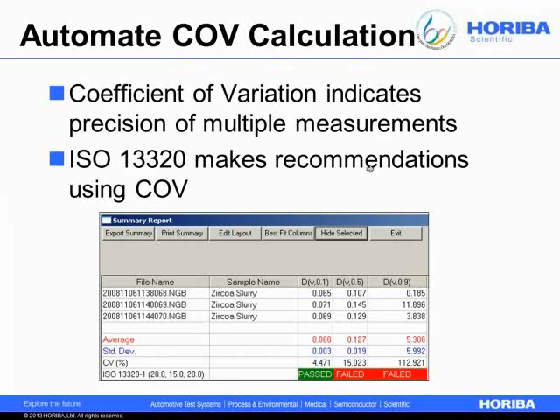One of the other things that's very, very good to do is if you're buying material or if you're screening incoming material, if you're classifying material to sell to someone, or if you're screening incoming material that you've bought, you'll want to make multiple measurements. If you just make one measurement, it can be misleading.